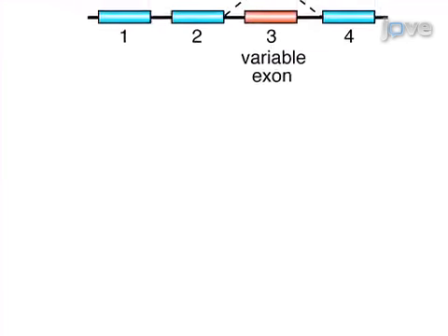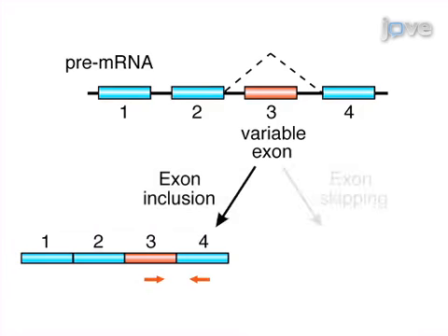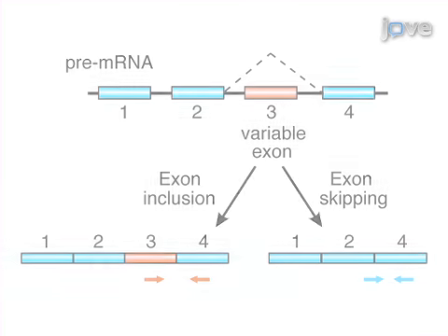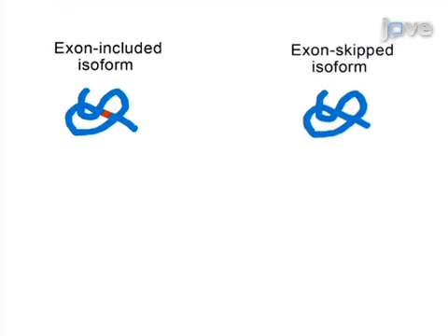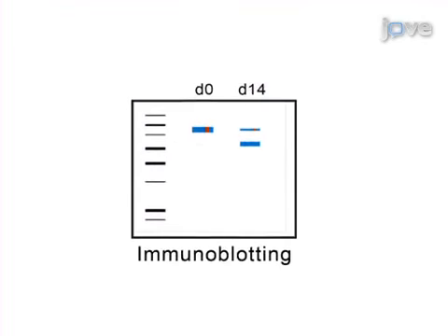As a second step, the expression of splice isoforms is analyzed by quantitative RT-PCR using isoform-specific primer sets, which reveals alternative splicing changes at the RNA level. Next, the abundance of protein corresponding to each isoform is determined by immunoblotting in order to confirm the expression of splice isoforms at the protein level.